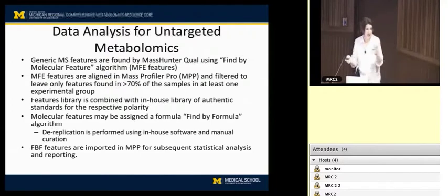So, I mean, Sasha's here and he can speak to this. Their software, Agilent software, which does the recursion, which is called ProFinder, up to a certain point, maybe 6 months or a year ago, was a little bit too slow to really do large batches like we needed it to do. And so more or less the same algorithm was available in a batch mode where you could do it offline.